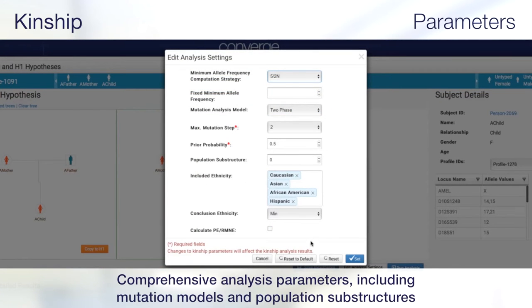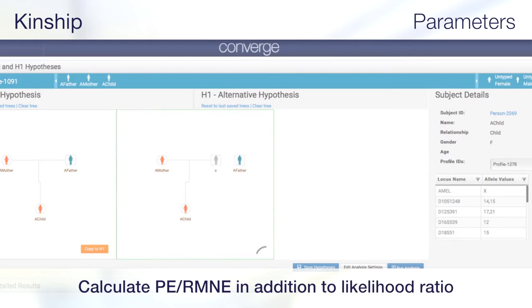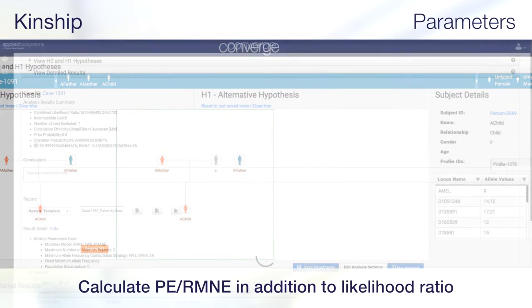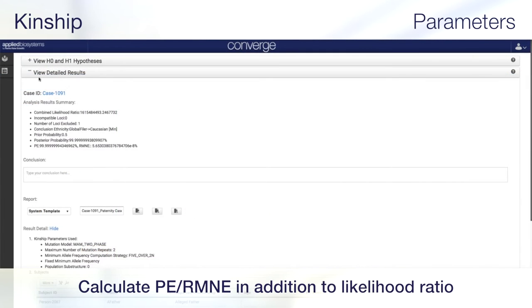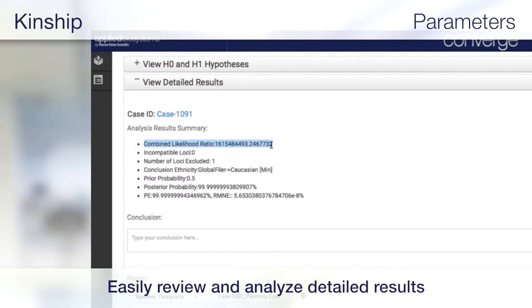Set comprehensive analysis parameters, including mutation models and population substructures. Also calculate PE-RMNE in addition to likelihood ratio. Once parameters are set, analysts can easily review and analyze detailed results including combined likelihood ratio, conclusion ethnicity, posterior probability, PE and RMNE.